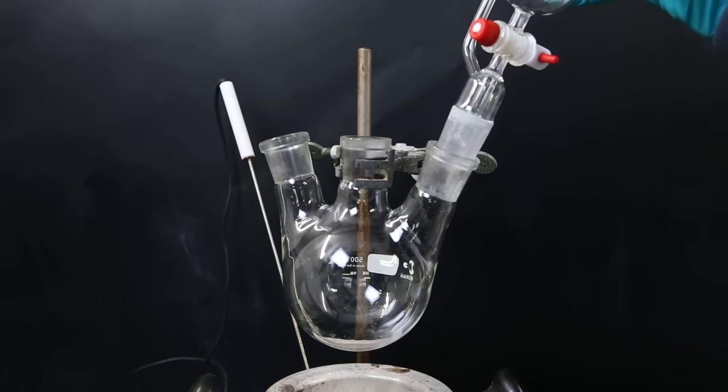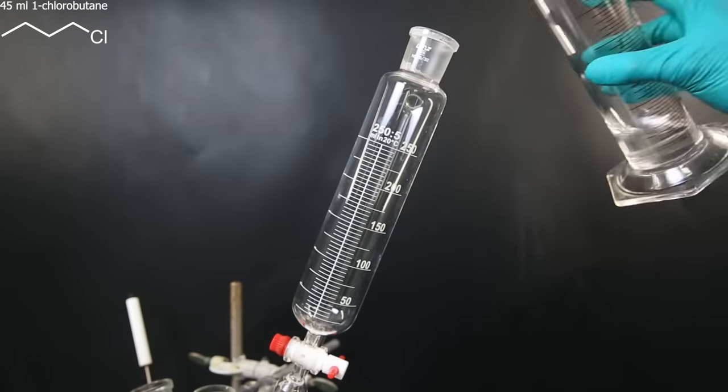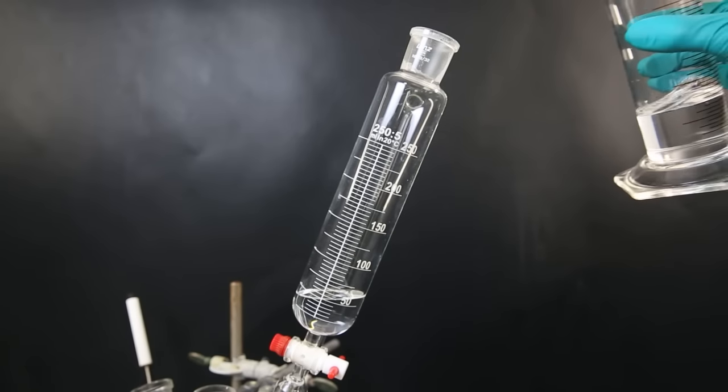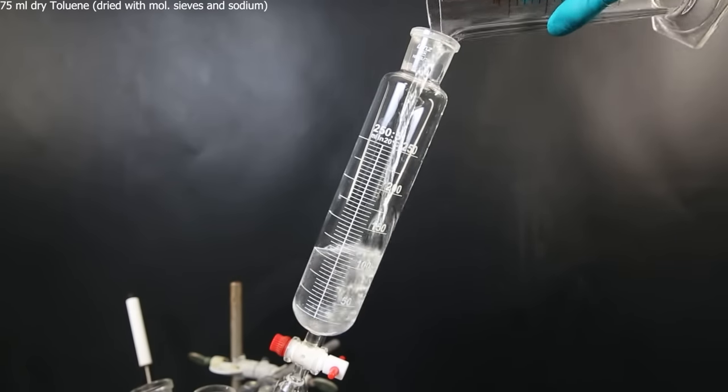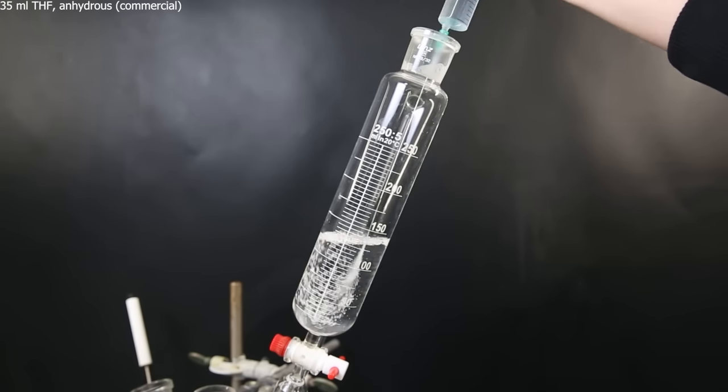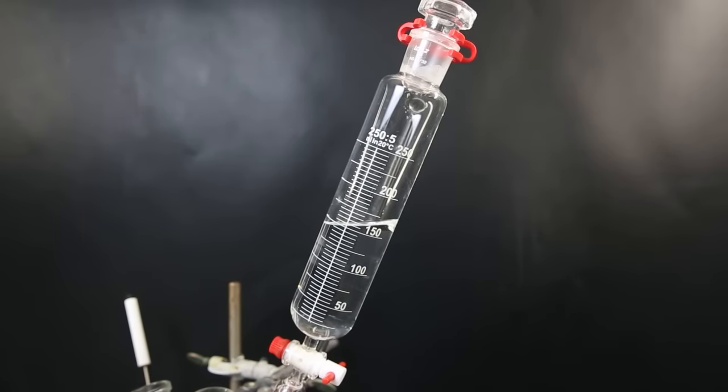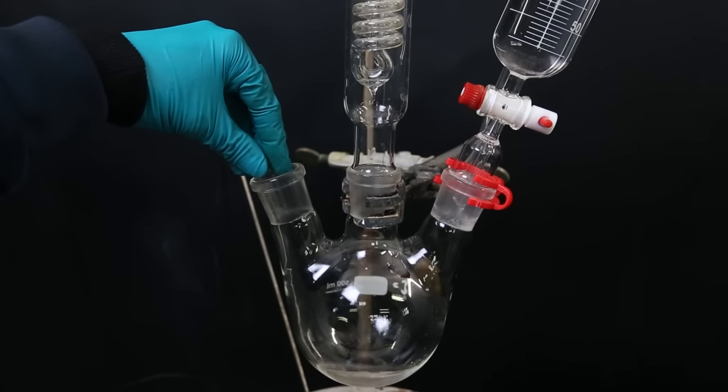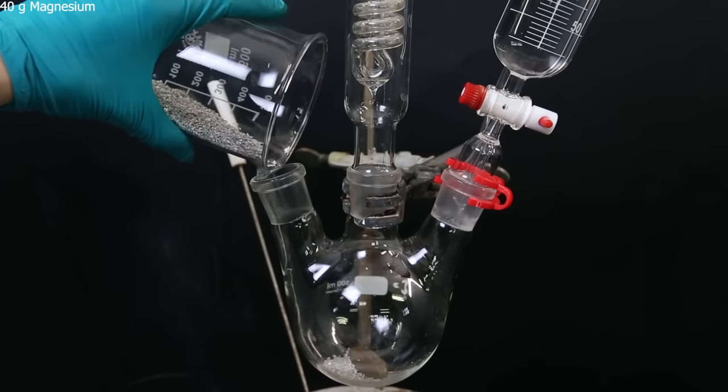So I set up a 3-neck flask and attach a dropping funnel. Now to the dropping funnel, I first add 45 ml of 1-chlorobutane. Then I add 75 ml of dry toluene and 35 ml of anhydrous THF. Now I attach a condenser to the flask, drop in a stir bar, and then add 40 grams of magnesium turnings.